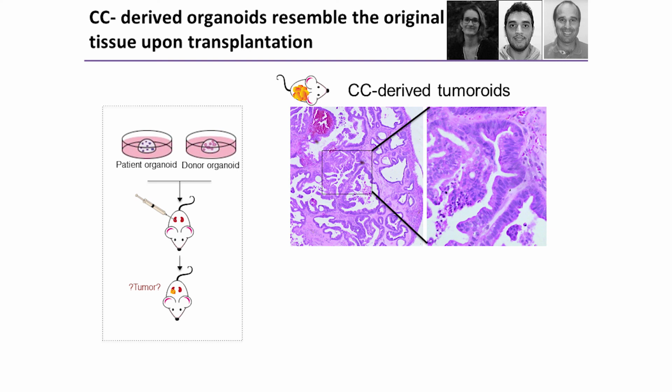But to me, more interesting is that they retain the histological characteristics of the original tumor when we transplant them. This is something that, to my knowledge, cell lines cannot do, and something that organoids, which retain the histological architecture, do very well. So these were organoids from that particular tumor that were transplanted after being grown for 5 months in culture. They were transplanted into a mouse, and you can see that they retain the memory of doing even this desmoplasia, which is classical of, in that particular case, a cholangiocarcinoma.